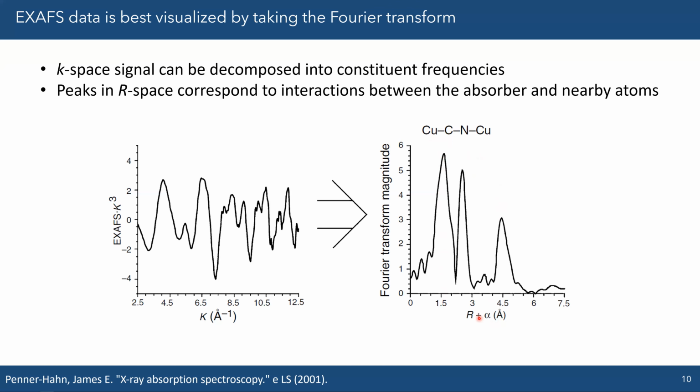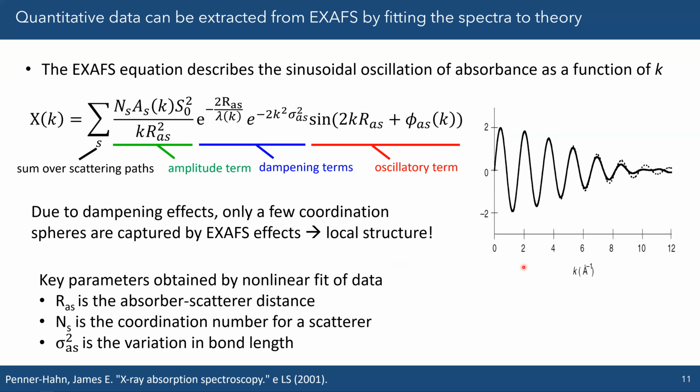some scattering effects and interference effects. So it doesn't actually give you that separation. So it's not as accurate as PDF. It's actually not really accurate unless you fit it.